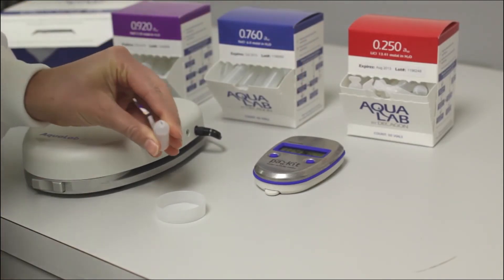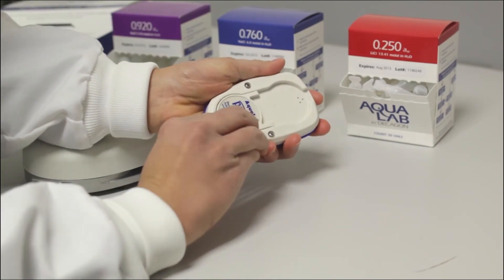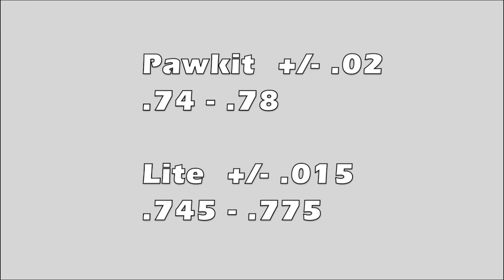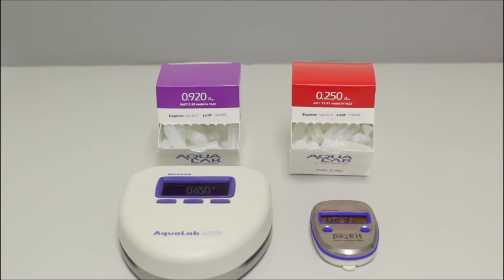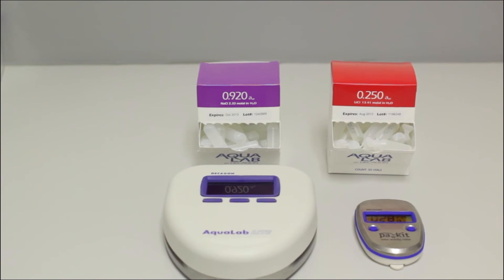You always want to use the .760 standard first, no matter what you are testing. You break open a vial of the .760 and pour it into a sample cup. If you have the pocket, you place the pocket over the sample. If you have the light, you place the sample cup inside the light. If the .760 standard measures between .74 and .78 in the pocket, it is measuring within spec and you can move on to the second standard. If you are going to test a product with a low water activity, then you want to use the .250 standard for the second verification. If you are testing a product with a high water activity like jerky in the .800 range, you want to use the .920 standard for the second verification.